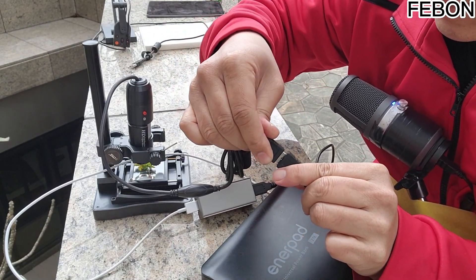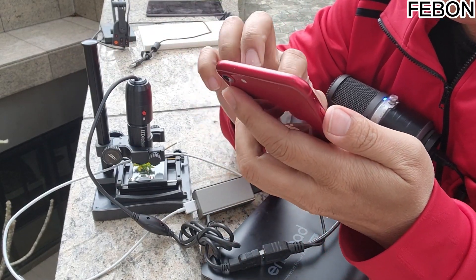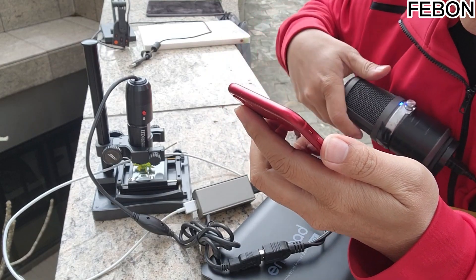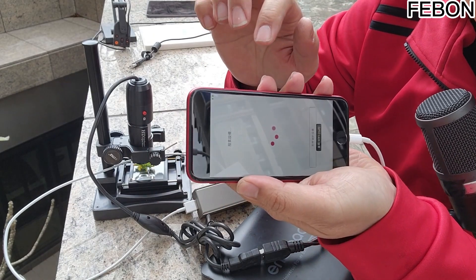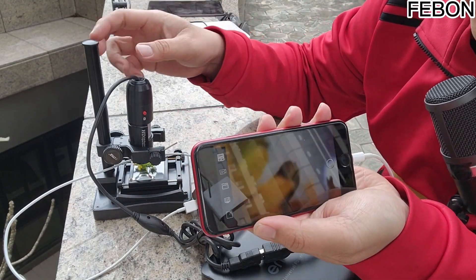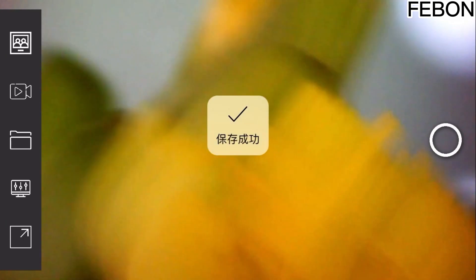So that it can be used. Then you need to turn on your iPhone and open the relevant app. Open the screen, so that there is a screen. I can adjust its height like this.